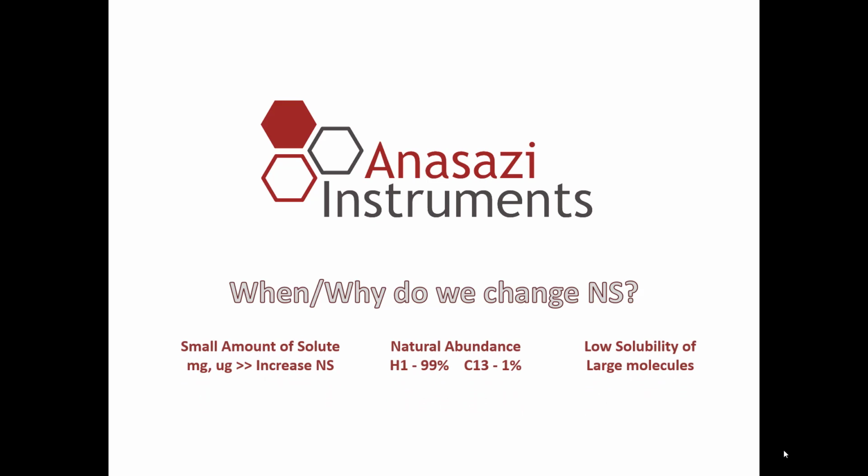When you are synthesizing a molecule or extracting something, sometimes you get very little amount, milligrams or micrograms. In that case, we are probably going to have to increase the number of scans in order to get greater amount of signal in our experiment.